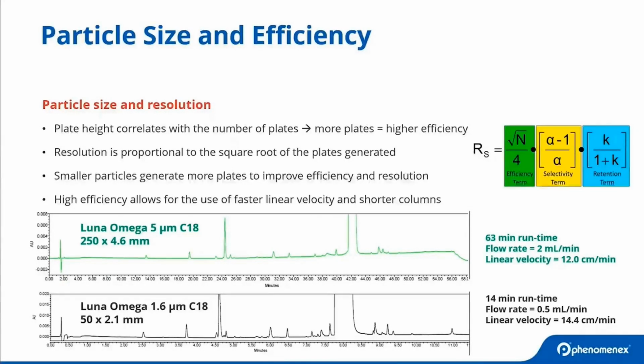So there is always opportunity also to consider the selectivity, which is actually a function of your choice of stationary phase, in addition to such method parameters as pH within your mobile phase. When we talk about particle size, we are specifically addressing the efficiency term within the broader resolution equation.